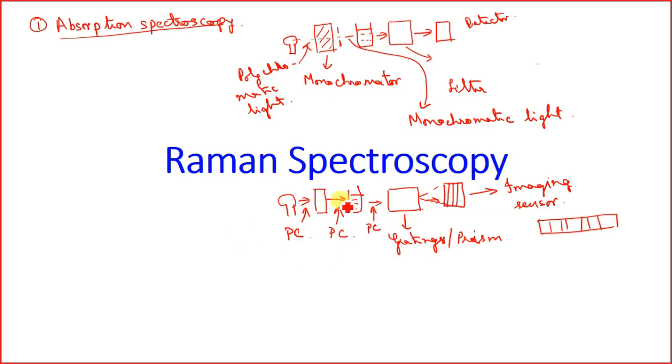So what was happening in absorption? If you see, everything is in a straight line order. The light is falling onto the sample, and we are basically calculating how much of the incident photons the sample is absorbing. This is absorption, IA, based on IT, that means the light which is transmitted through the sample.